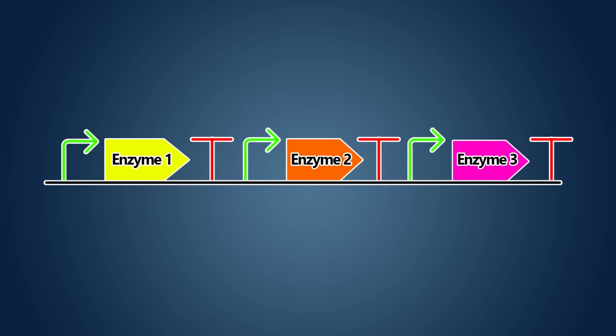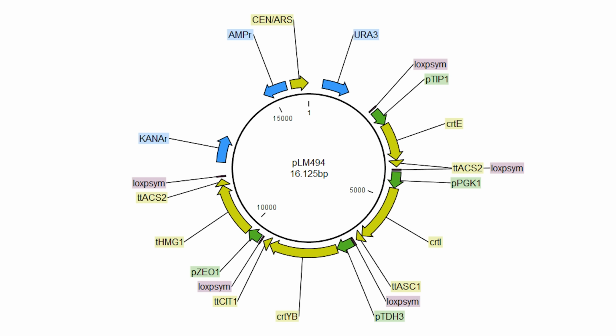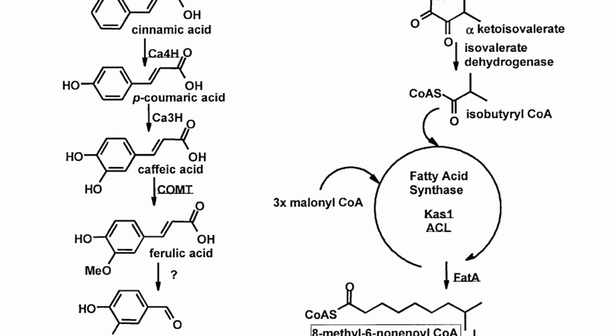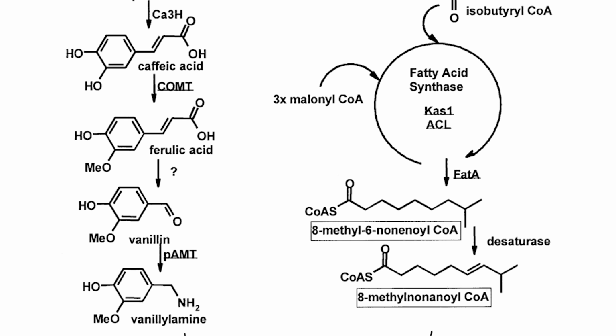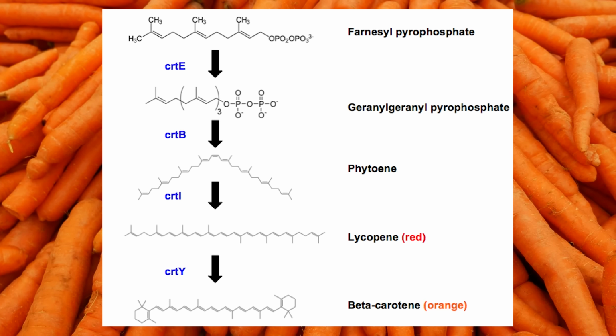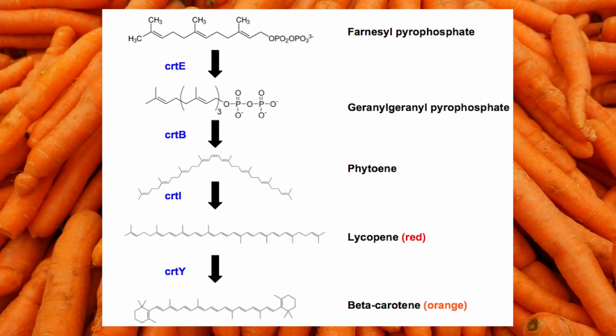By following the pattern of promoter, gene, and terminator many times in the same plasmid, you can express multiple things and build pathways where chemicals are handed off between enzymes to make more complex chemicals, or break something big down. With beta-carotene, not only do you need the enzymes to make the actual carotene itself, you also need to add extra enzymes that make parts of the yeast metabolism more efficient and overproduce some of the starting materials.